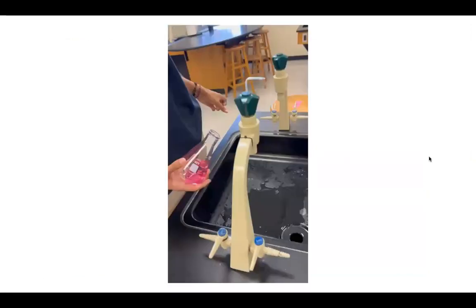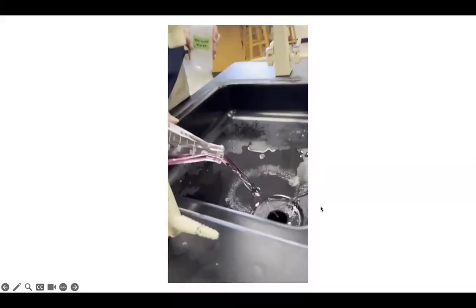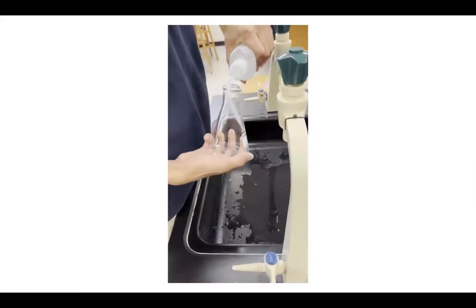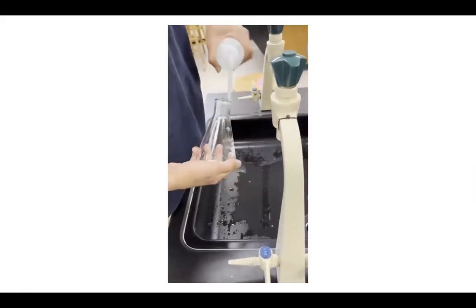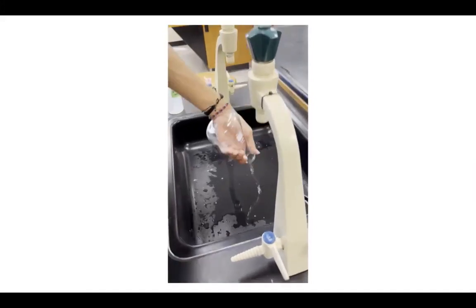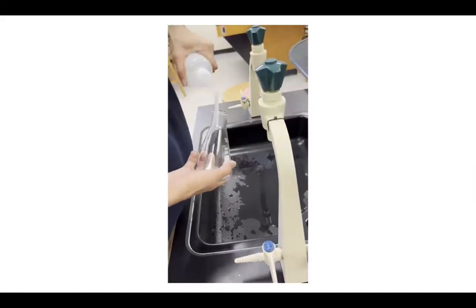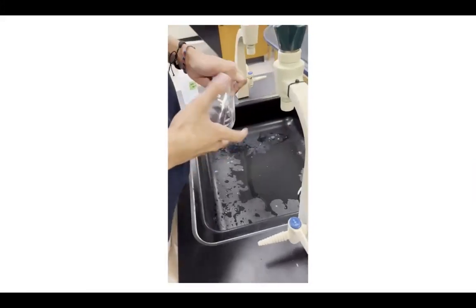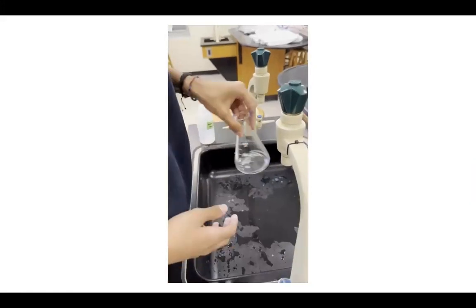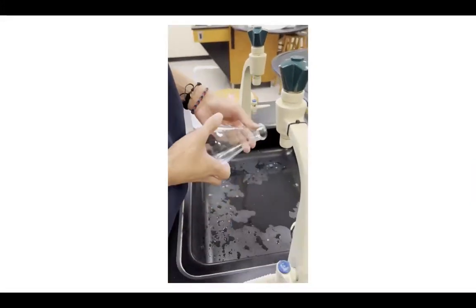Before you continue the titration, you have to use that same conical flask, so you're going to pour out and clean this conical flask. So how do you do that? You take the conical flask, pour it out into the sink, then using distilled water, clean the sides of the flask thoroughly. Rinse it around to make sure that you get all of the particles and molecules of Fa1, 2, and 3, and then do that 2 more times. Now this is clean and can be used again for the future titrations.